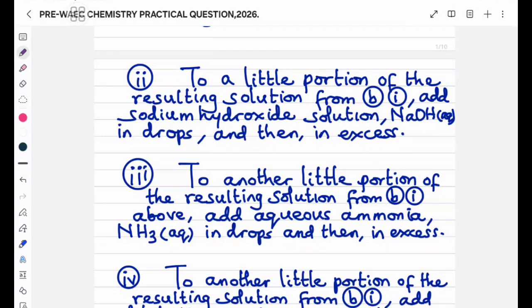Allow the mixture to stay for a while. Most of the white particles will settle at the bottom of the boiling tube or test tube that you are using. You only need a solution, not much of it. Some of the residue, precisely the inorganic salt, will dissolve in the acid.